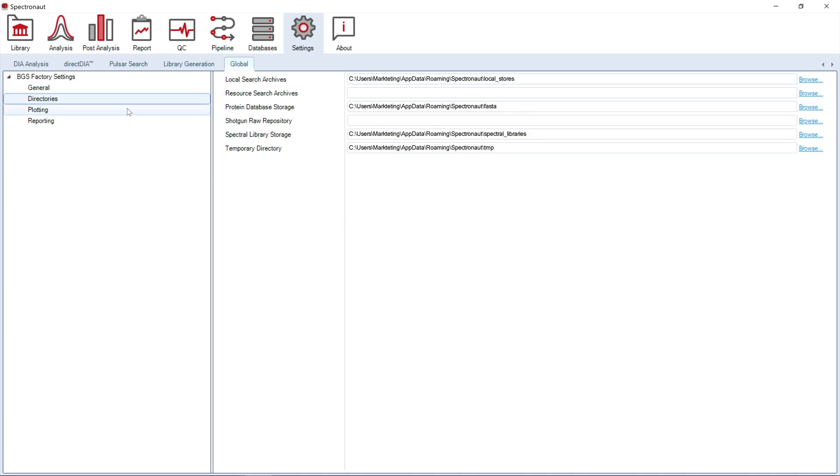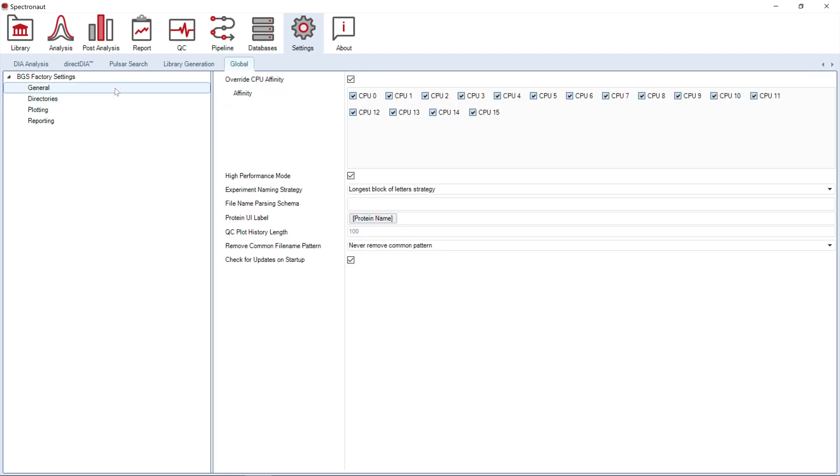Spectronaut is designed to perform highly resource-intensive tasks, especially when running searches with Pulsar, biognosis proprietary search engine. If you would like to utilize your system resources for other parallel tasks, you can set a maximum number of CPUs used by Spectronaut in the CPU Affinity node.